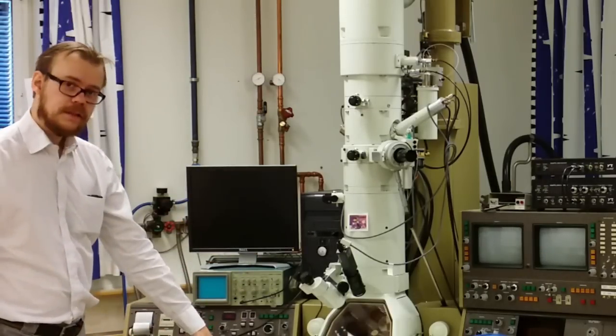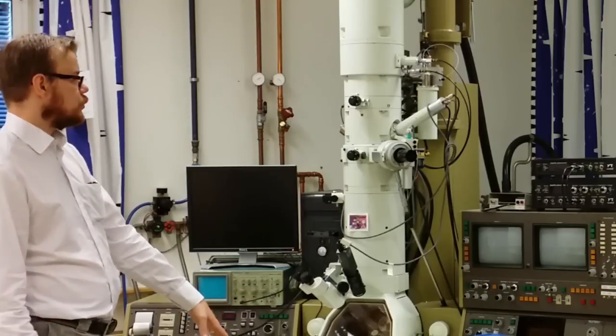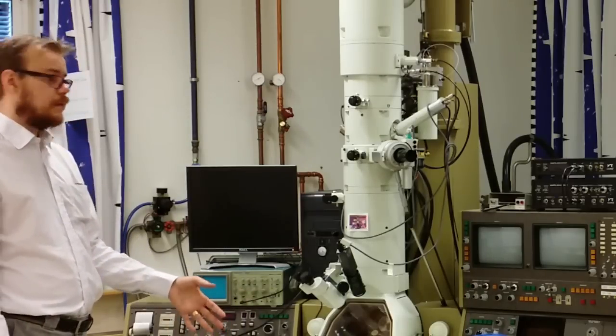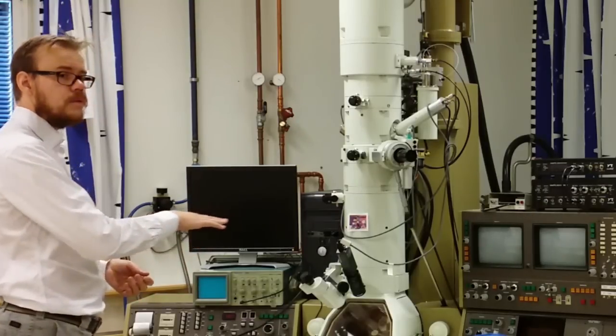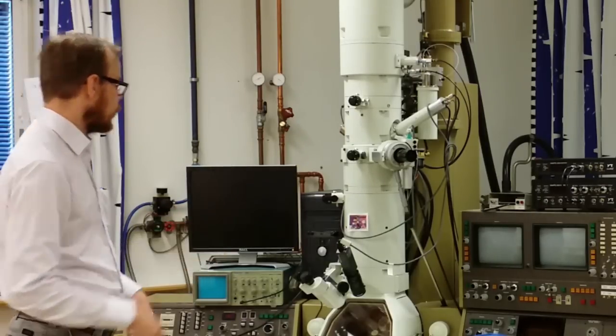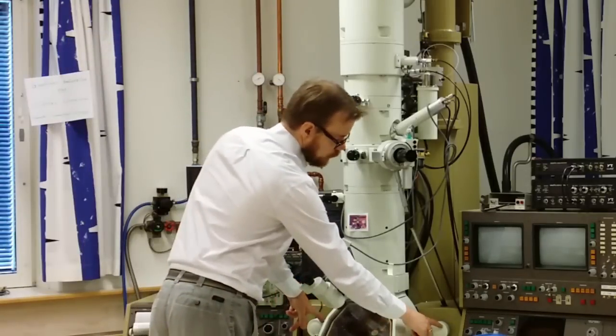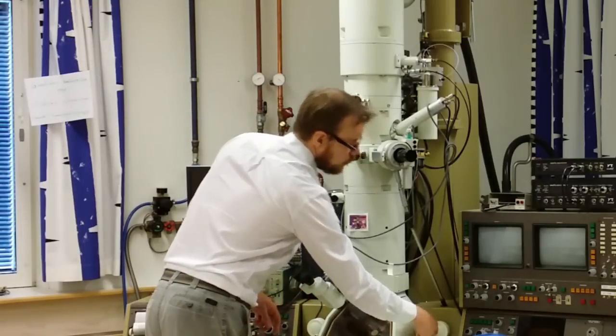On the bottom you also have pedals. The pedals you use to tilt the sample in different directions. To position the sample across and change the view of the sample that you are viewing, you use these two knobs. These you can turn and then the sample will move.